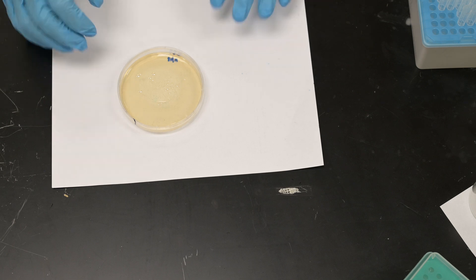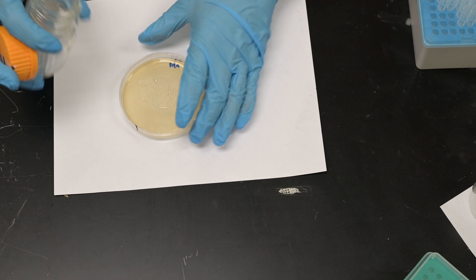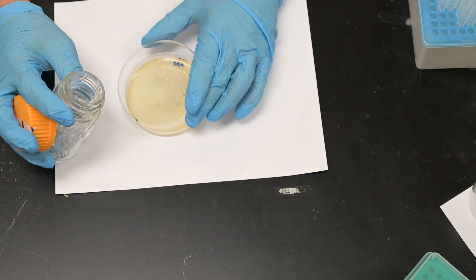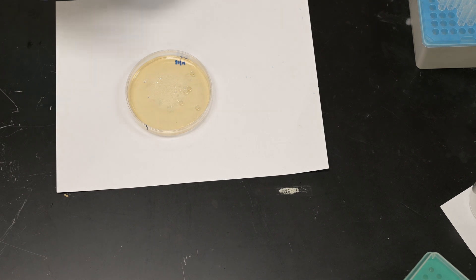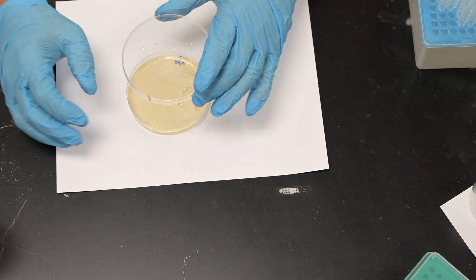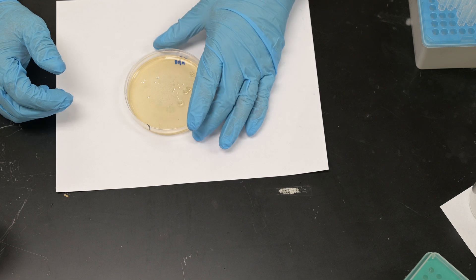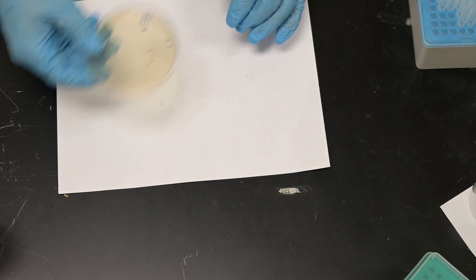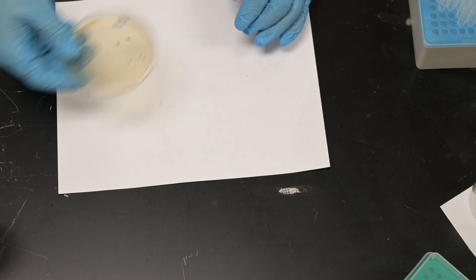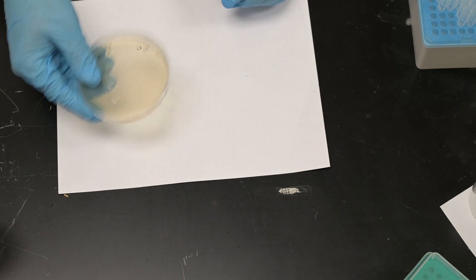So we now have the plate with the transformation on it. What I'm going to do is get some sterile glass beads and knock three to four different beads onto the plate. Notice whenever I lift the lid, I lift it straight up so I can just dump the beads in — this helps prevent anything from falling onto the plate and contaminating it. Then after the beads are on the plate, you just wiggle the plate around and let the beads go over the entire surface of the agar. It's a pretty straightforward, easy technique.